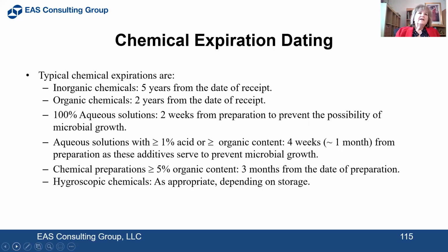Here are some typical expiration dates. Inorganic materials, 5 years from the date of receipt. Organic chemicals, 2 years from the date of receipt. Aqueous solutions that are 100% aqueous, 2 weeks from preparation to prevent the possibility of microbial growth.